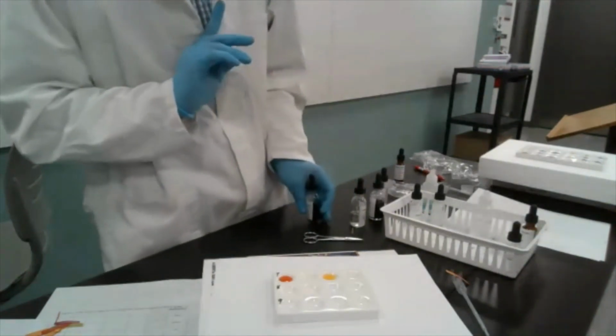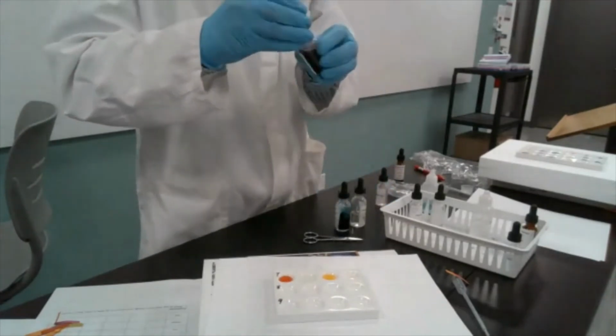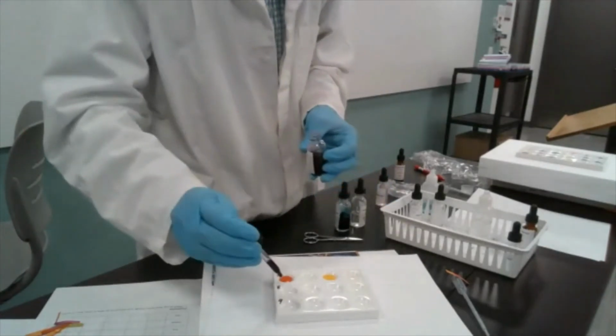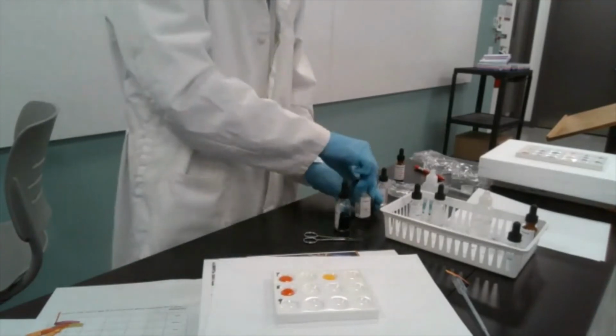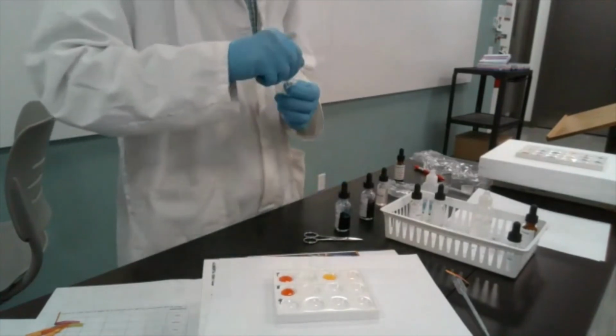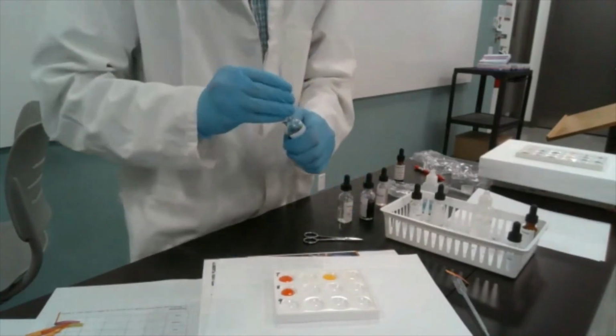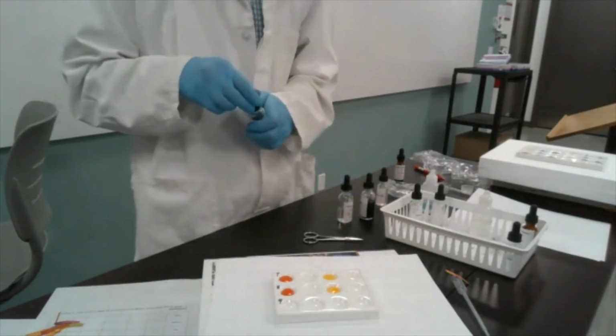Let's see about number 8, vinegar. Again, here you probably know the answer already, but well, we're going to do it because it's on the list. Again, blue litmus, phenolphthalein, and bromothymol blue.